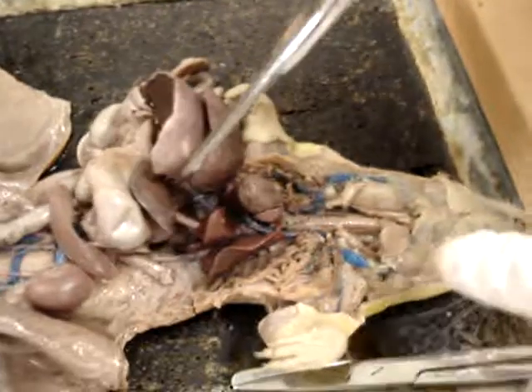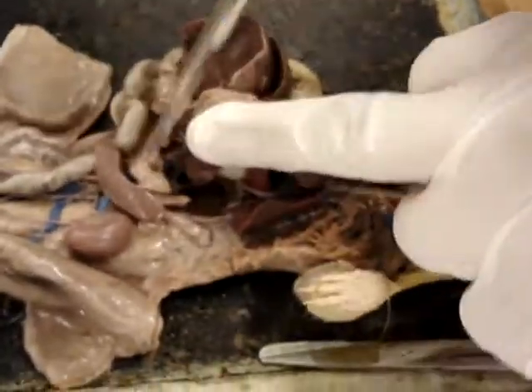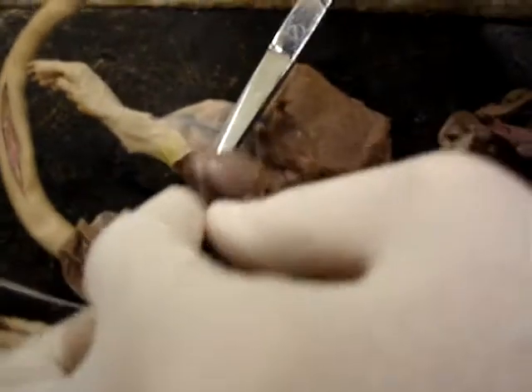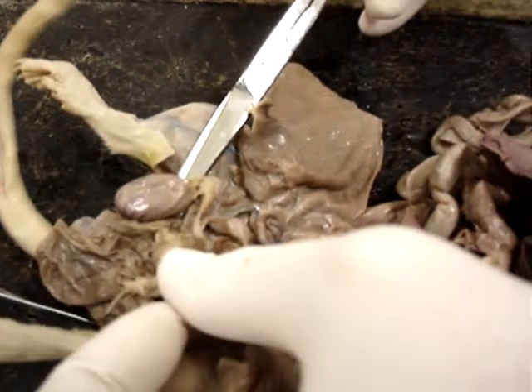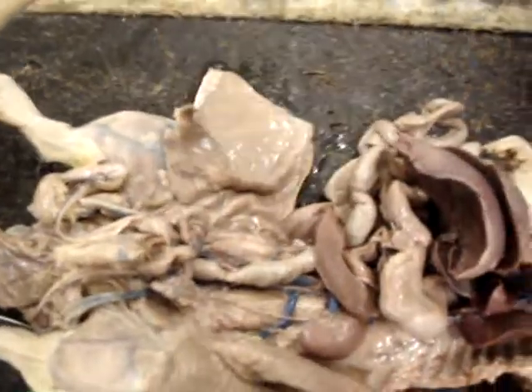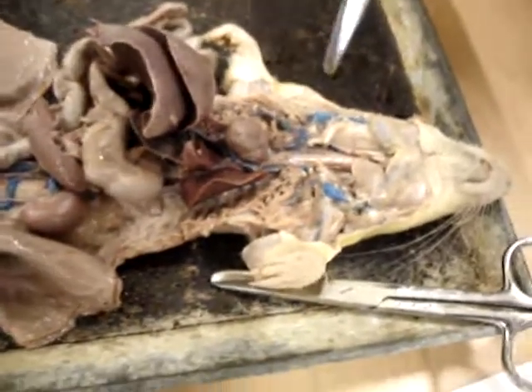Pancreas — we've gone through that. The testes would be this one here. This is a male rat, so we don't have an ovary. The pituitary gland — you have to open up the brain to see the pituitary gland; it's visible in the sheep brain.